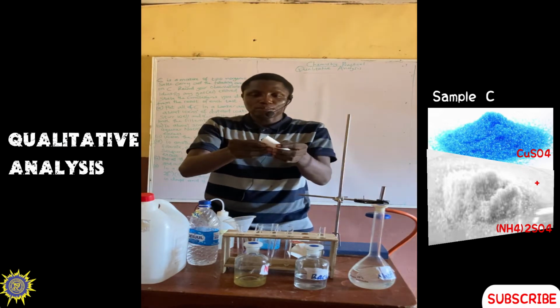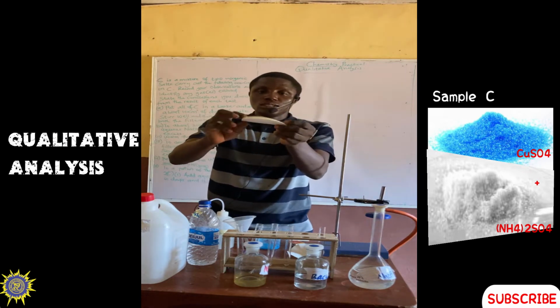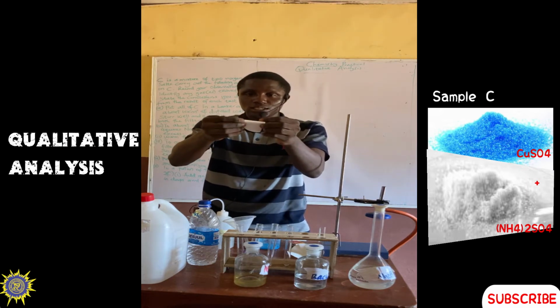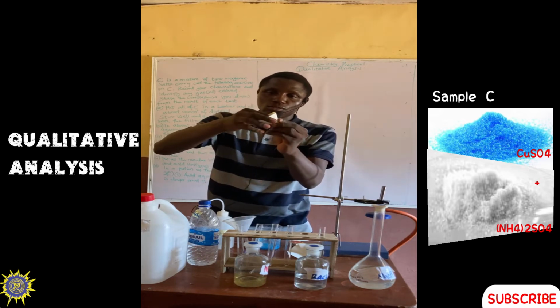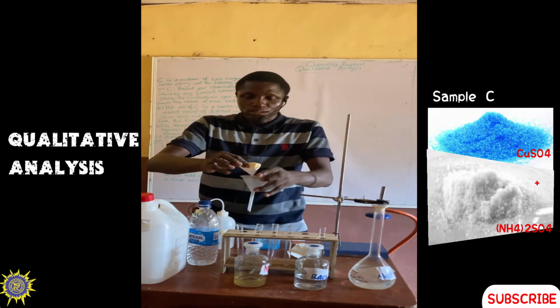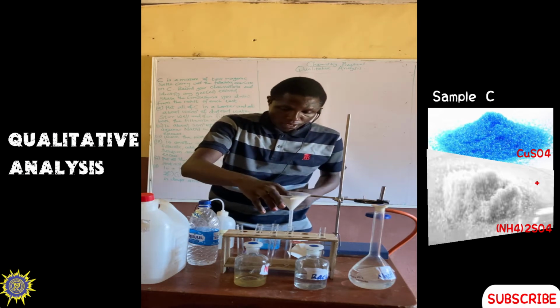So you fold your filter paper like this. You fold it into two equal halves. Then the half also you fold it. So you have the cone here. Then open it from one side to form a cone. You place the cone on the funnel, then you place it on one of the test tubes.